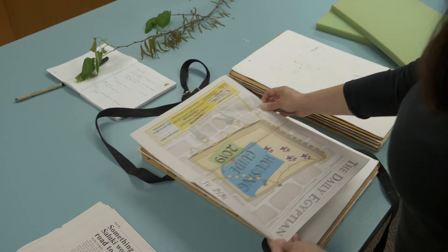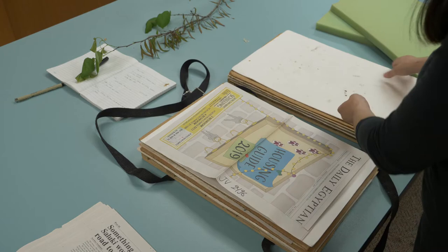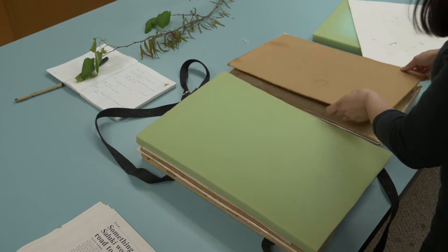Now we're going to put this in the press. In this case, as this sample is kind of three-dimensional and we want it to be very flat, we're going to skip the second blotter. Instead of that, we're going to put a piece of foam, so the foam will gently move all the pieces down, and then a corrugate on top.